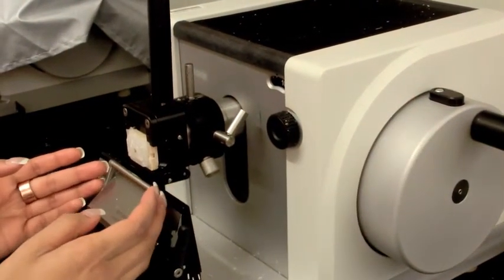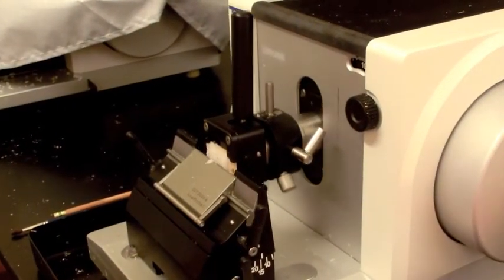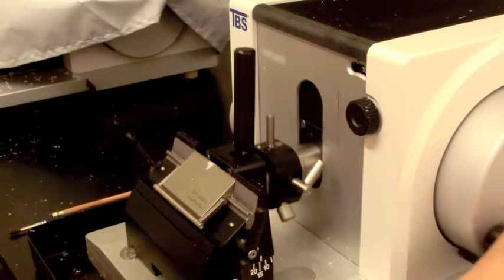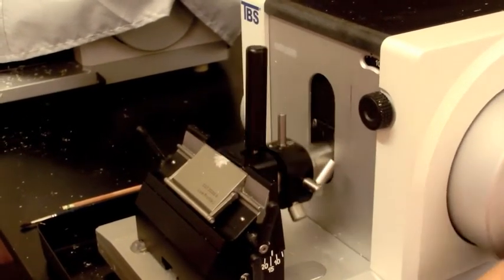Unlock the wheel on the right by pushing the pin button down. Next, place both hands on either side of the finger guard and pull it down as to reveal the microtome's blade. Remember to always lock the wheel into place when you are not sectioning.